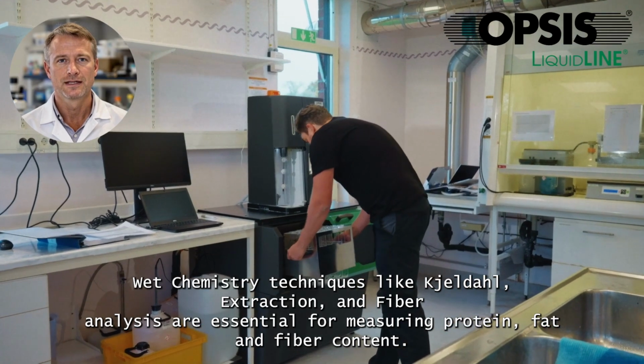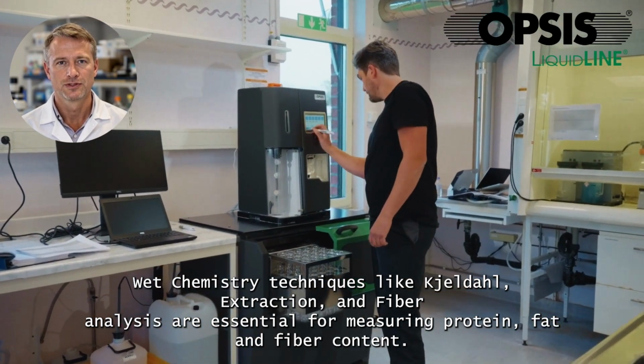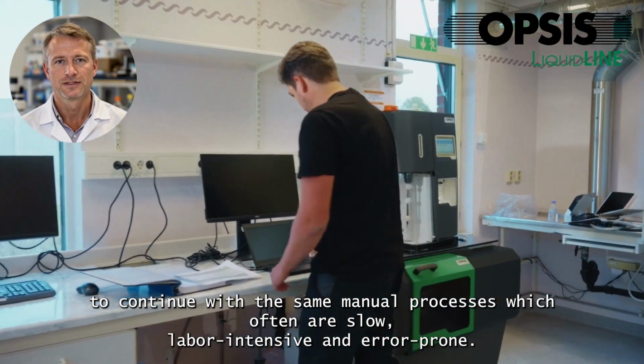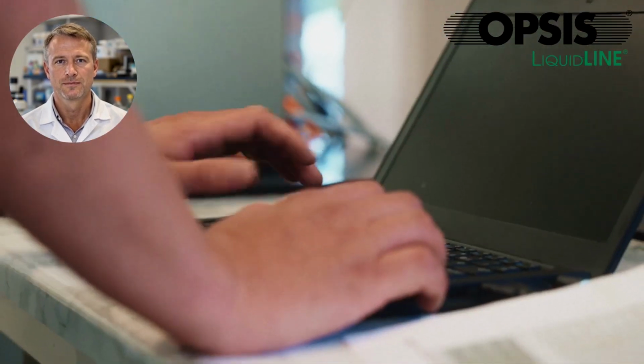Wet chemistry techniques like Kjeldahl, extraction, and fiber analysis are essential for measuring protein, fat, and fiber content. However, while the methods are necessary, it is not always necessary to continue with the same manual processes, which often are slow, labor-intensive, and error-prone.